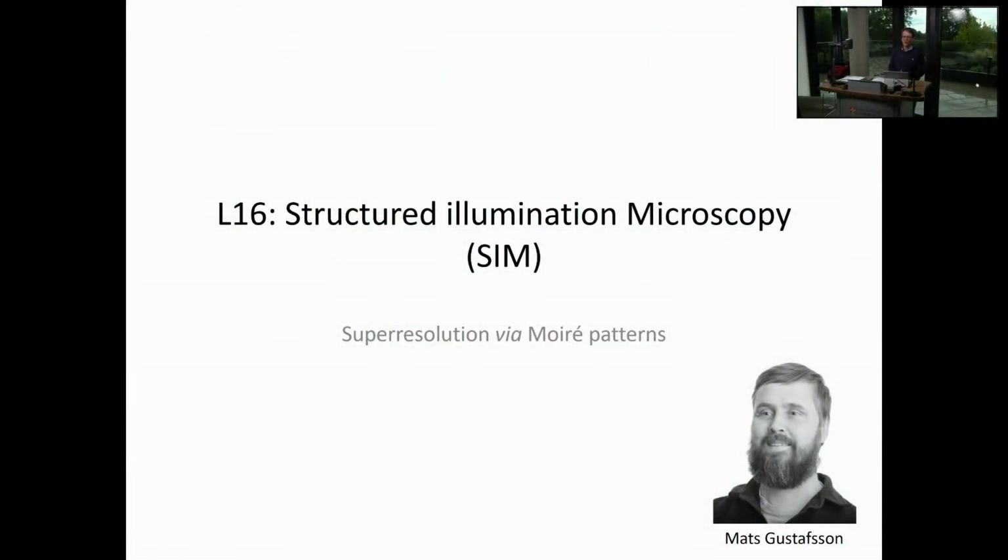I will, with this, go to my presentation and show you the title slide here, which has on it the inventor of this technique, SIM, or Structured Illumination Microscopy, Mats Gustafsson. In my view, he would have been very deserving of the Nobel Prize. Unfortunately, he died before that was possible for him, far too early. I mean, he died before he was 50.